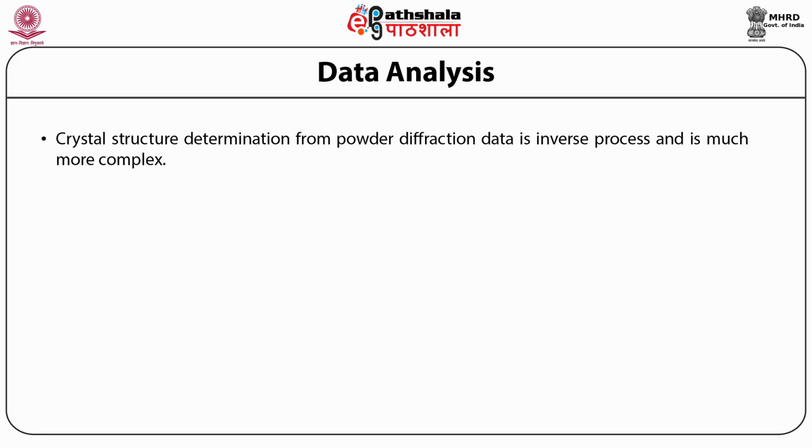Third, the peak intensities are used to determine the space group symmetry and also the coordinates of the atoms. Finally, the entire diffraction pattern is used to refine all crystallographic and peak shape function parameters, including the background. Let us recollect Bragg's law.